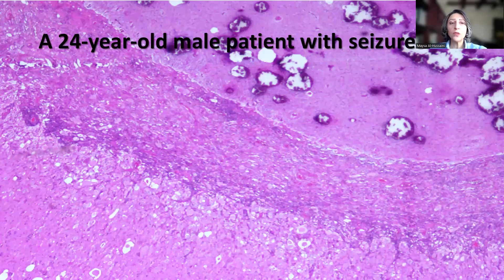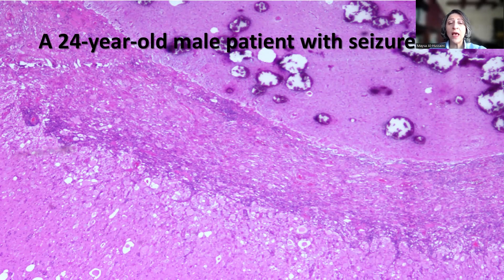This is a 24-year-old male patient who presented with seizure and was found to have a space-occupying lesion in the temporal lobe, for which he underwent resection. As you can see from the low-power magnification, there are areas of coarse calcification, which were actually identified on imaging, in particular on the CT scan.